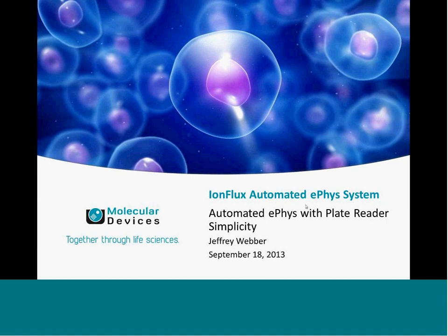So today we're going to go over a brief overview of the system, how the system operates. We're going to highlight temperature control as a key feature of the system, and then we'll go through some example data.